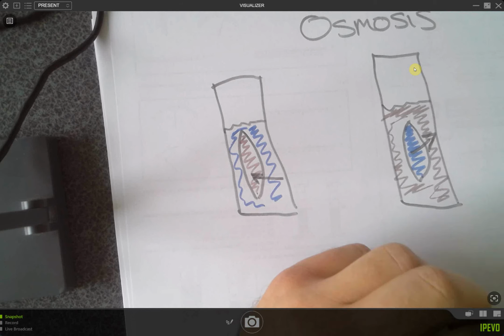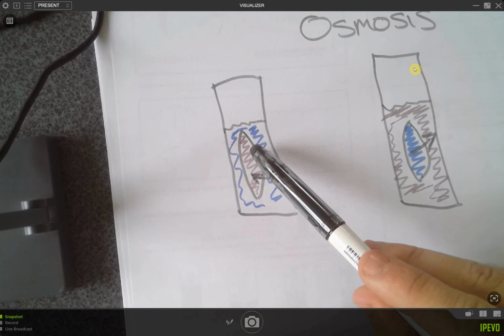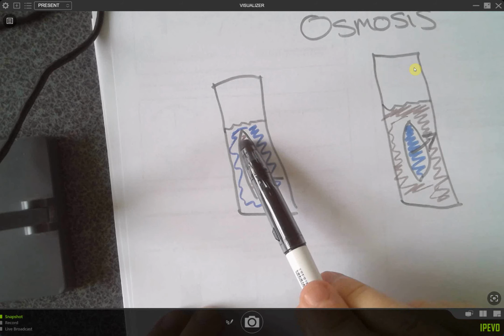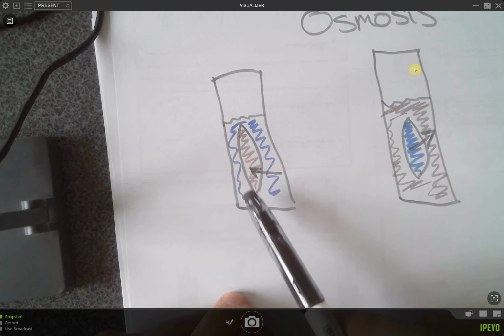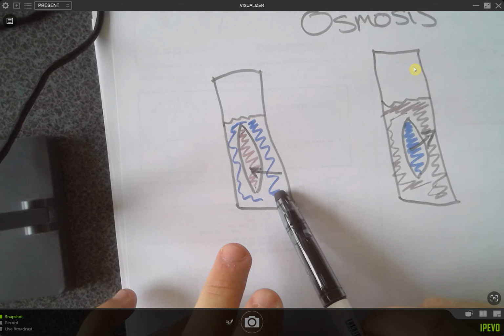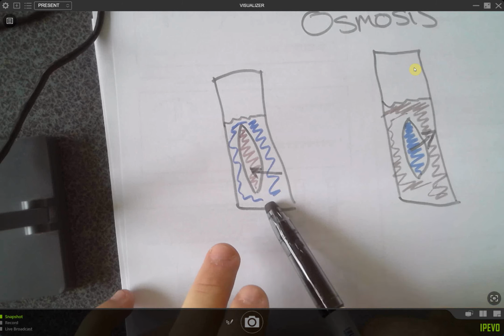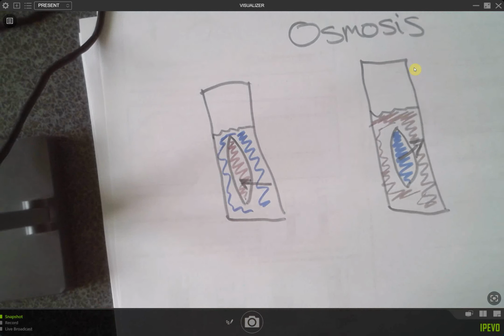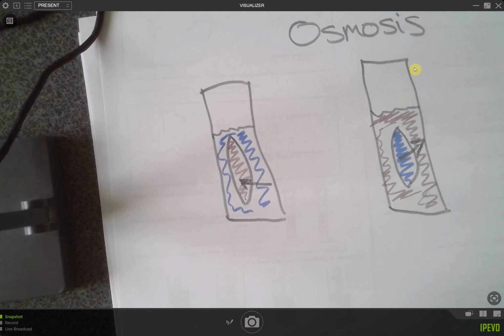Some of you would have seen that the water changed color. So like in this first one here, you had some of the brown come out of the sugar and out of the bag and actually leaked into the water. So if that happened, what probably happened was you didn't tie the bag tightly enough, and so the sugar could actually move, it actually leaked out of the bag because you didn't tie it tightly enough.